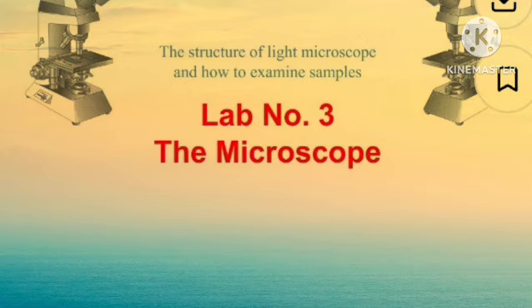Next slide, the microscope. Microscopes are very important in microbiology. Previously I told you what a microscope is, which is essentially important, and I told you the types of microscopy.